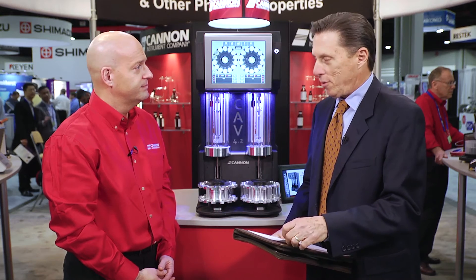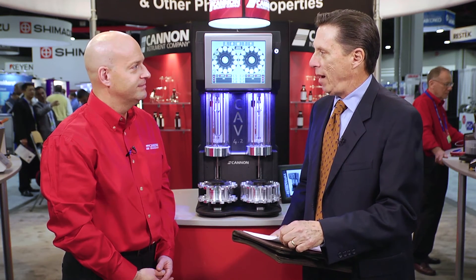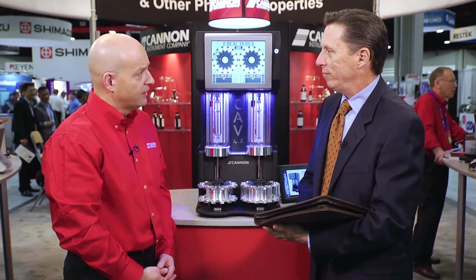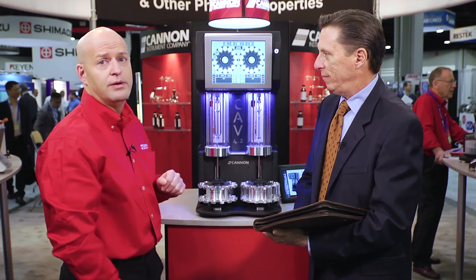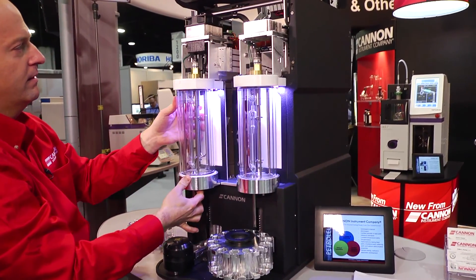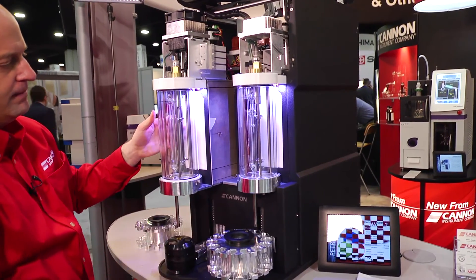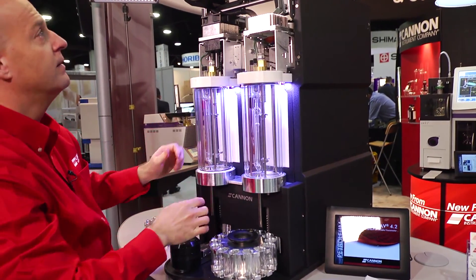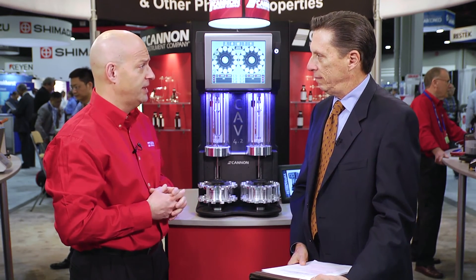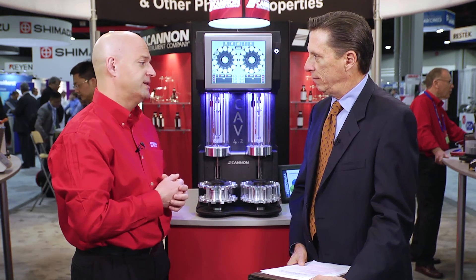Ease of use has become a critical feature in many laboratories today with things being more technical and higher test volumes. Are there any other significant features that add to that? From a serviceability standpoint, the system is extremely modular. It's a bit like a transformer — the tray opens up, the electronics come up, and the baths are removable, all while the system is operating, so you do not need to turn it off to do system maintenance. The entire system operates on DC power, so there are no electrical shock hazards. We can do calibrations and cleanings while the other bath continues to operate.